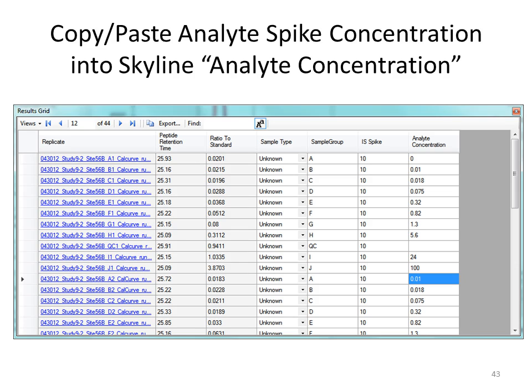So the concentrations for analyte concentration should match up with these A, B, C, D and so on. So there was one in the document grid, then? Yeah, so just keep that analyte concentration blank and shift the guys below it down. You should be able to highlight them and move them down.